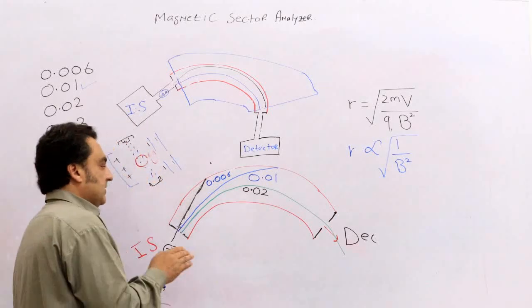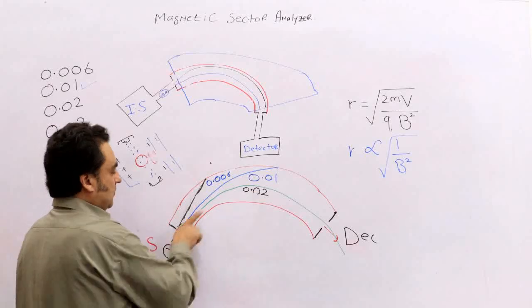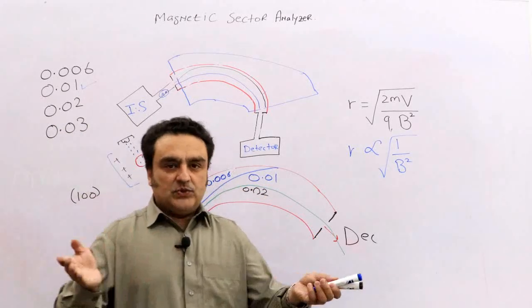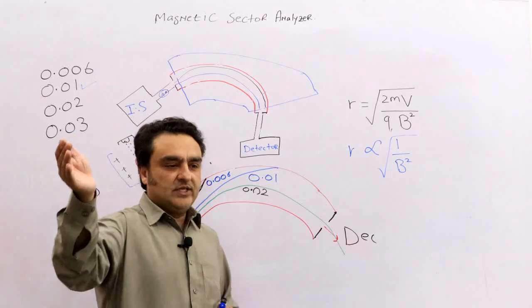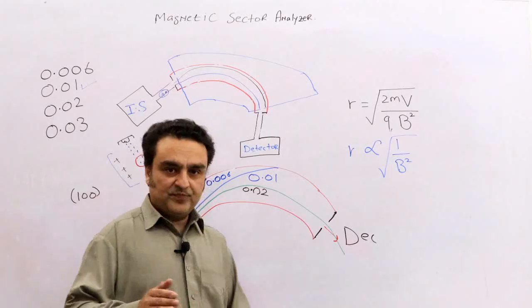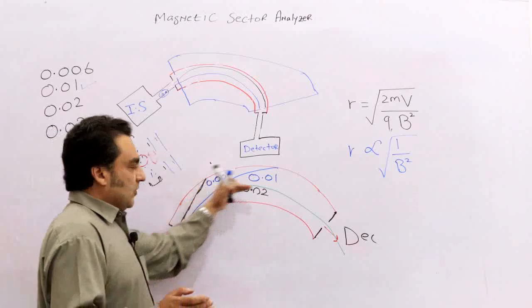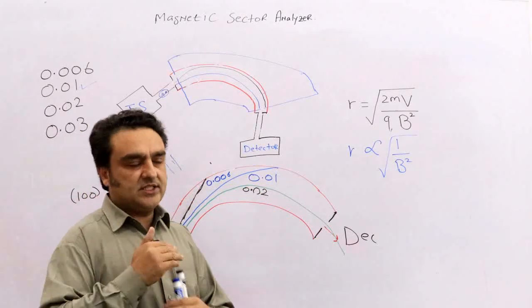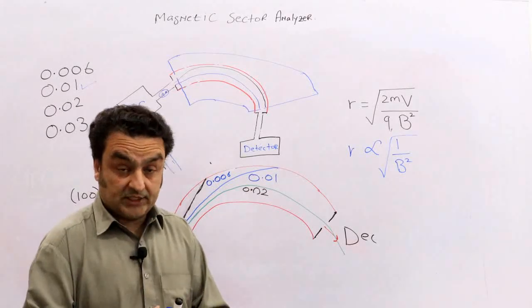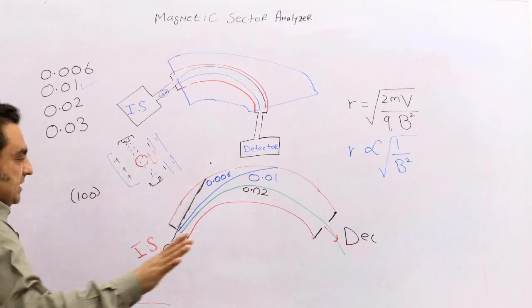You cannot go to the other stage. But suddenly at 0.02 it went to the detector, and, congratulations, you have done your second game. You are in the second stage now. But this is for one molecule. Believe me, this doesn't work like this. I am doing it so that you may understand the actual phenomenon. But this is easy.